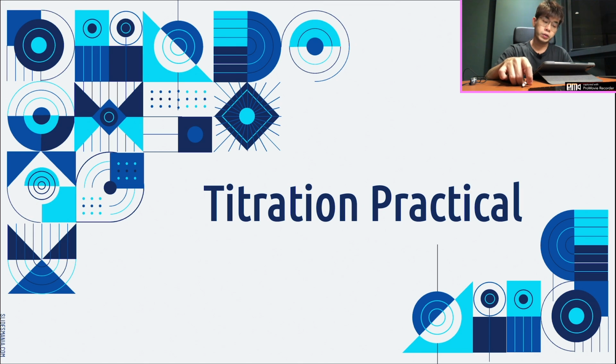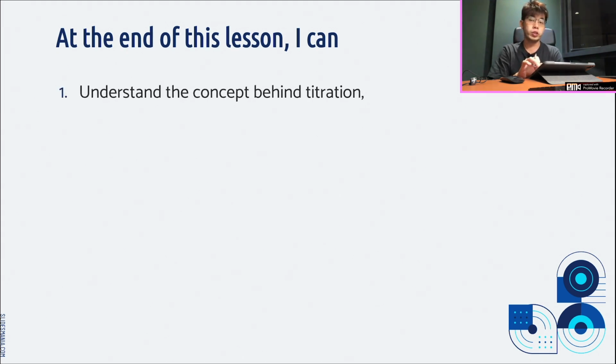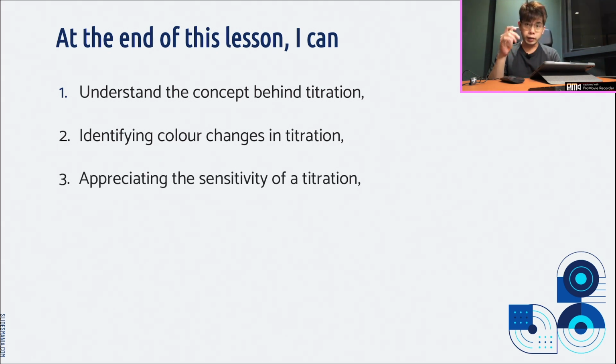Hi everyone, so today we'll be learning more about the titration practical. By the end of this lesson, you will be able to understand the concept behind titration, and identify the different color changes that happen during titration. You should also understand that titration is a very sensitive procedure and therefore requires a lot of care.